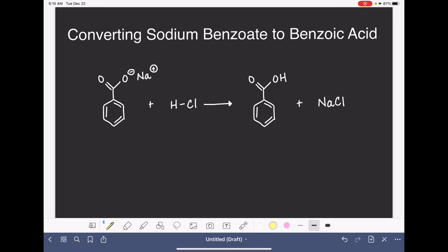In this experiment, we're going to be converting sodium benzoate to benzoic acid. Sodium benzoate is an ionic compound, and because it's an ionic compound, it dissolves in water. So we're going to begin by taking about 2 grams of the sodium benzoate and dissolving it in about 10 milliliters of water.